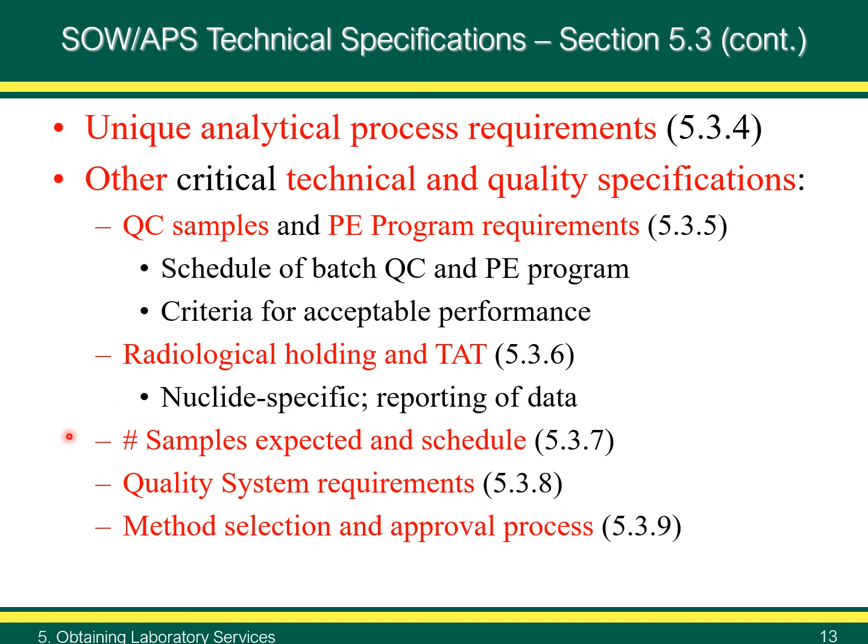Other requirements would include the number of samples expected and schedule for their receipt. This is discussed in MARLAP section 5.3.7. The SOW should state the estimated sample load by schedule, if possible.